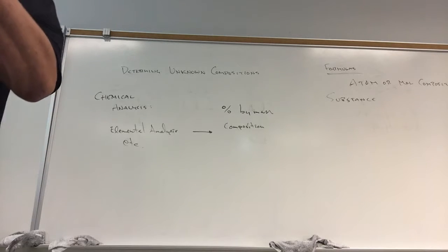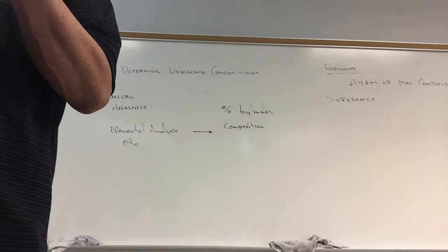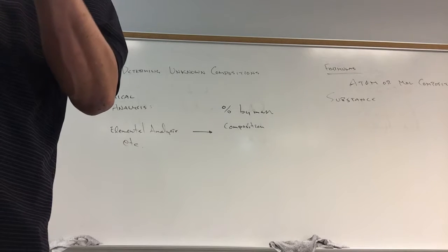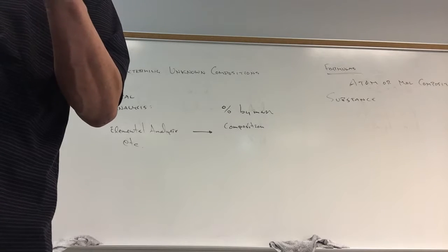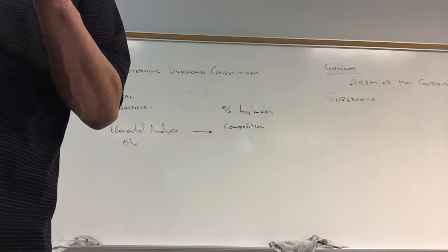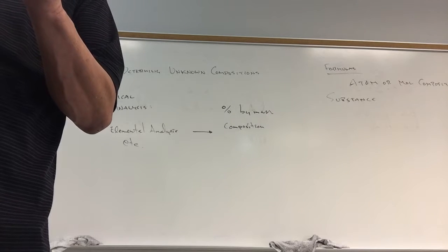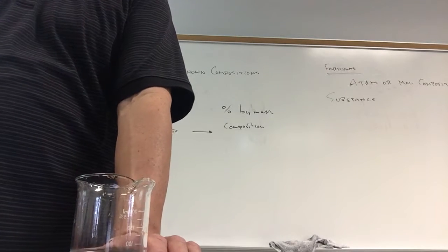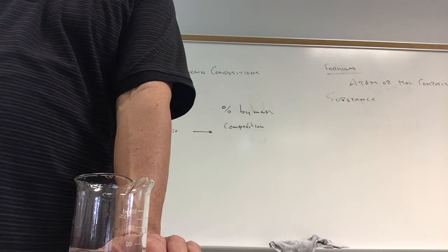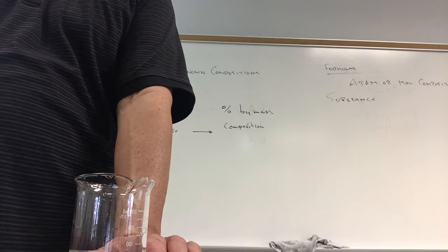And so next element I'll analyze for is oxygen. It was about 88% oxygen. And so this sample was about 12% hydrogen, 88% oxygen. What is it? It's water, right? Water is H11O88, or around there, H12O88.